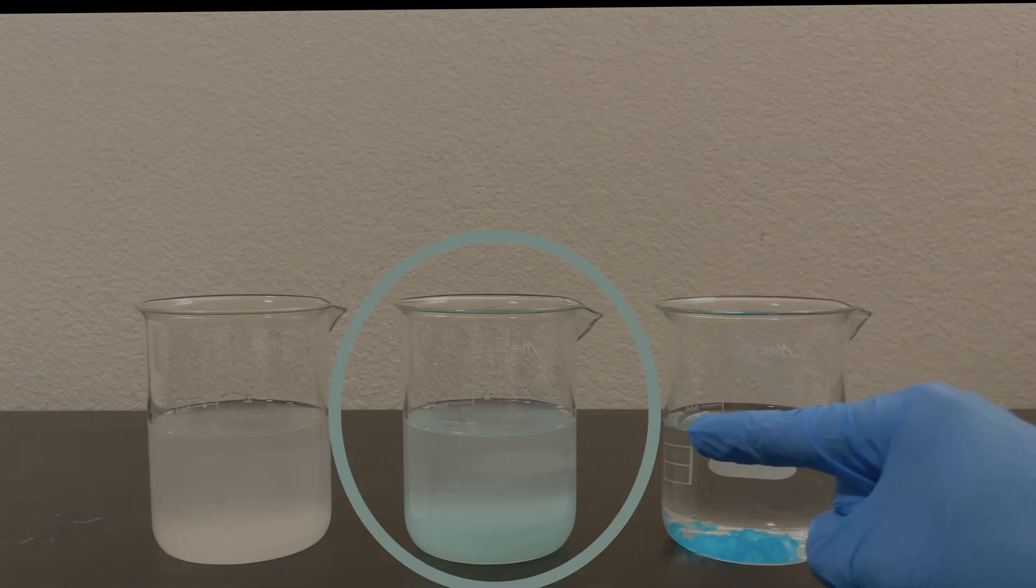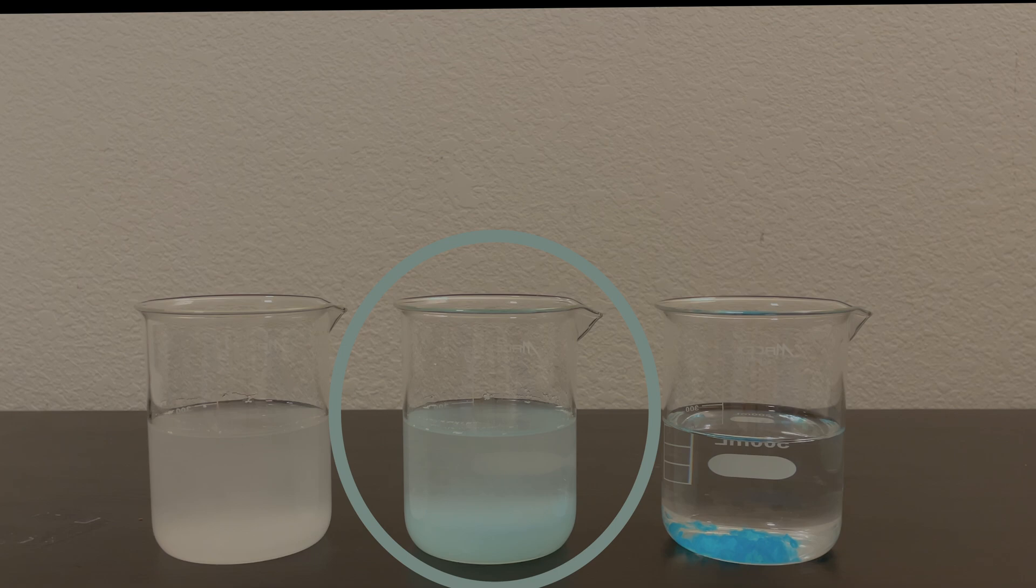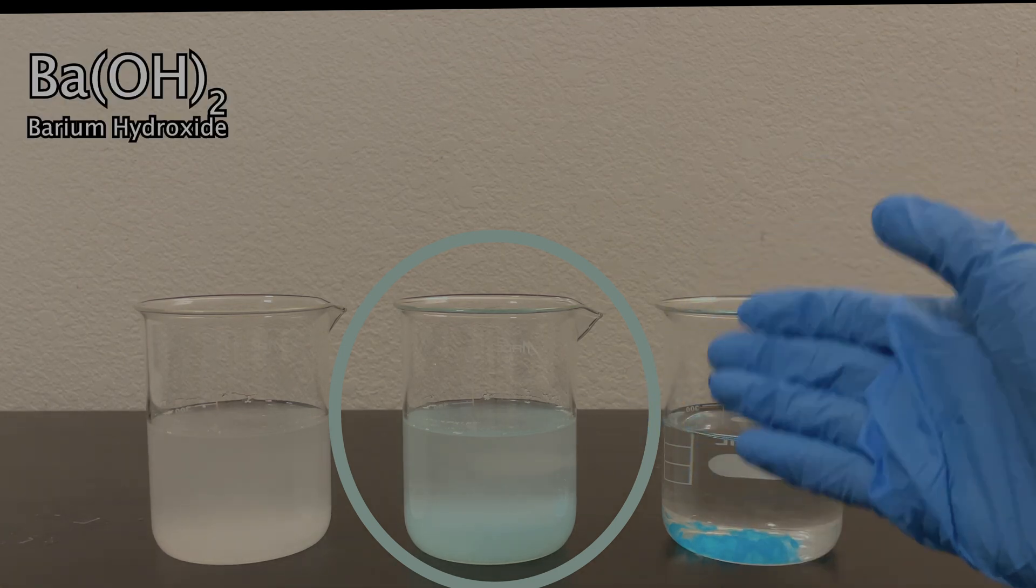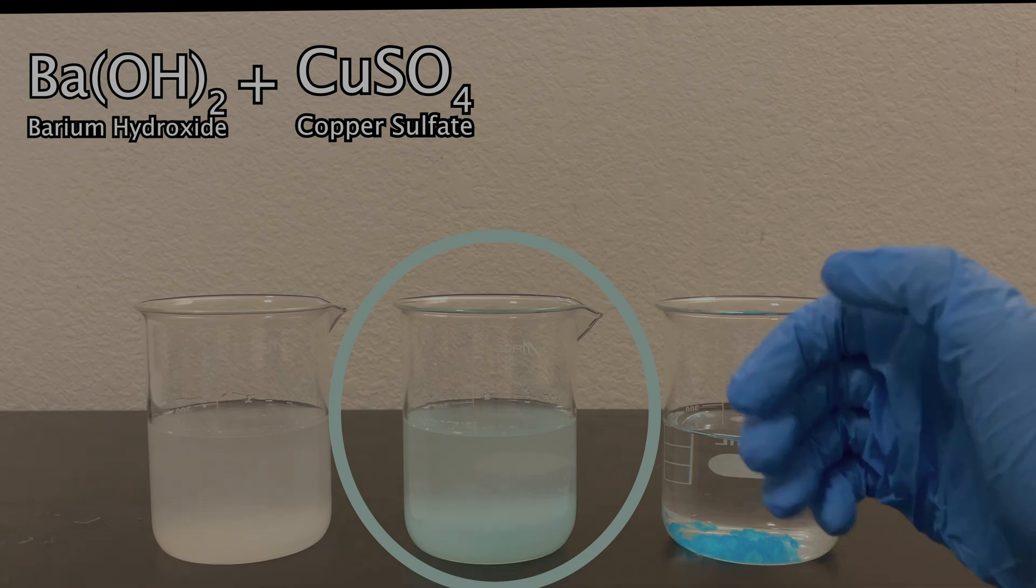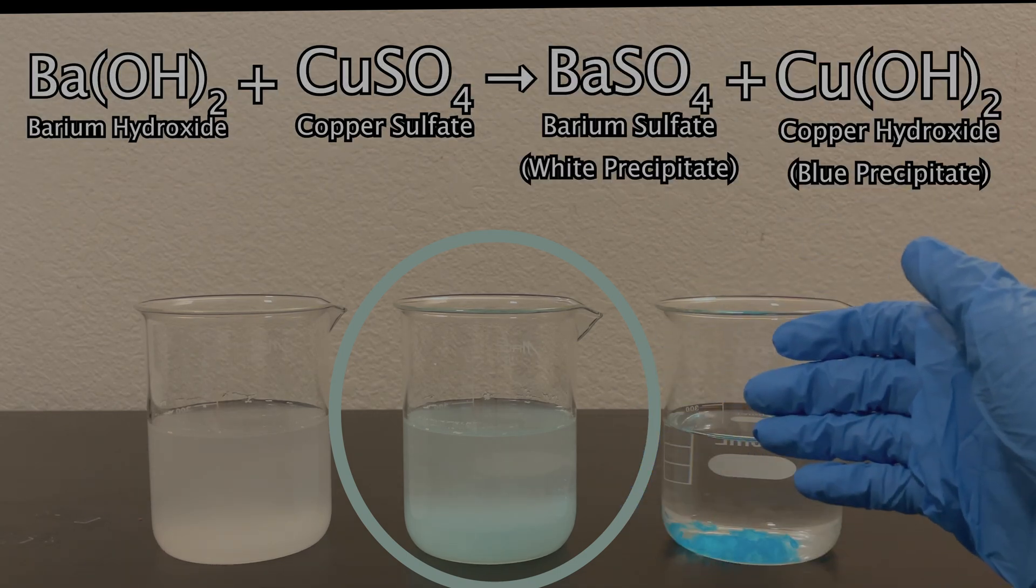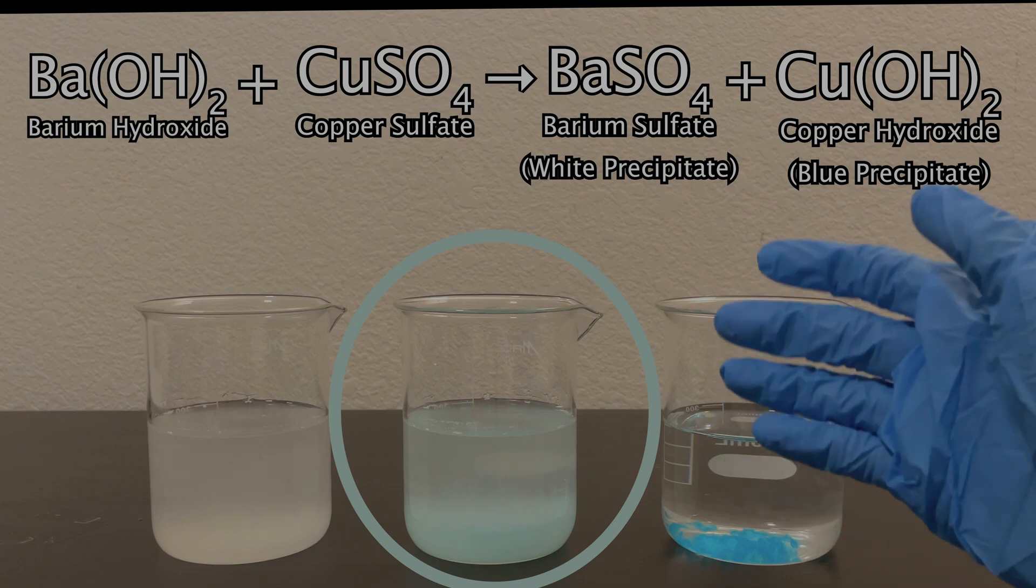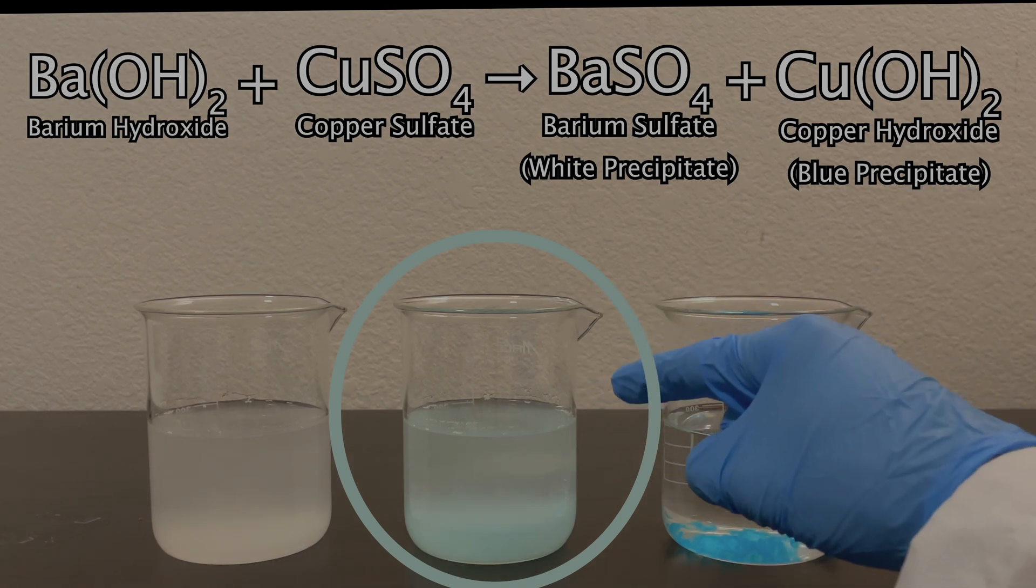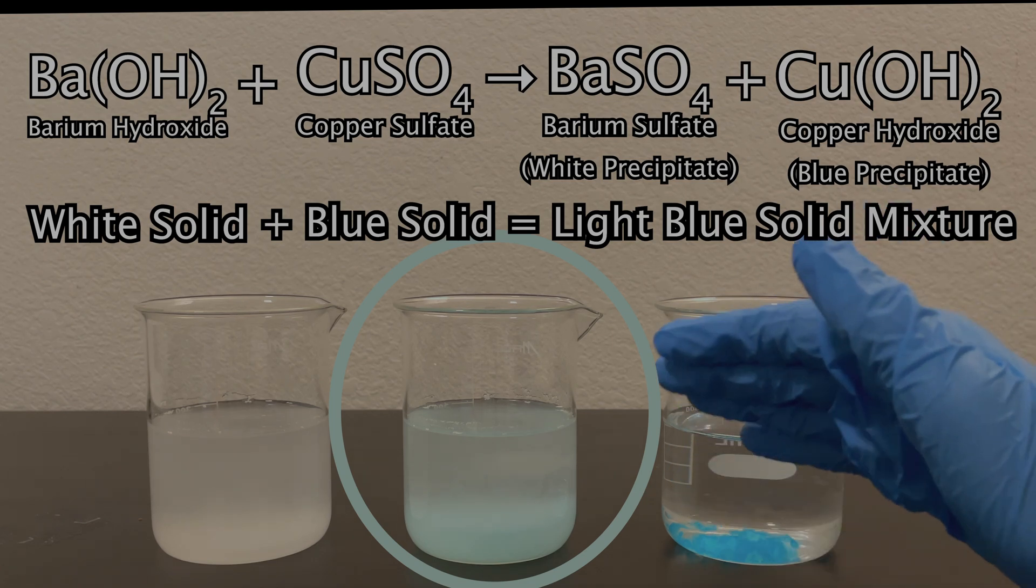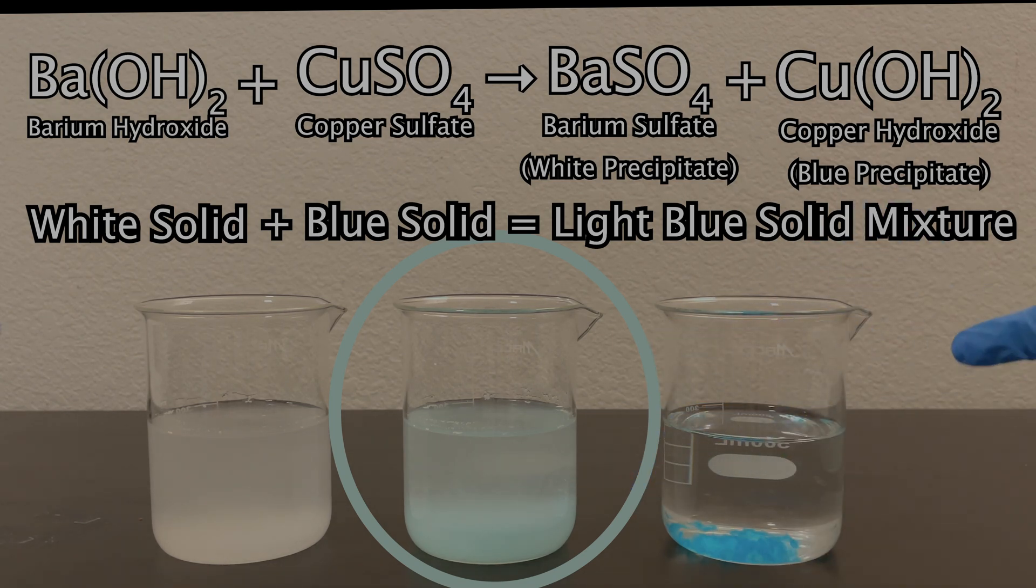In the middle, I did kind of a mixture of the two. I started with barium hydroxide and then added copper sulfate, so I created both barium sulfate and copper hydroxide. Therefore, the color of the resulting solid mixture in this middle beaker is an intermediate of the colors of the individual precipitates from these other two beakers.